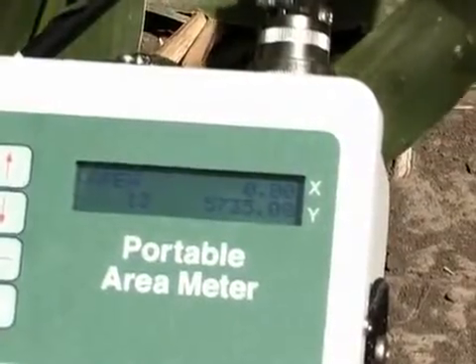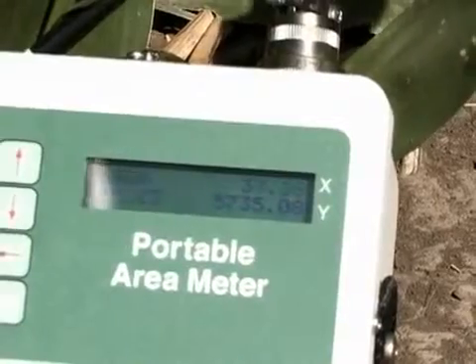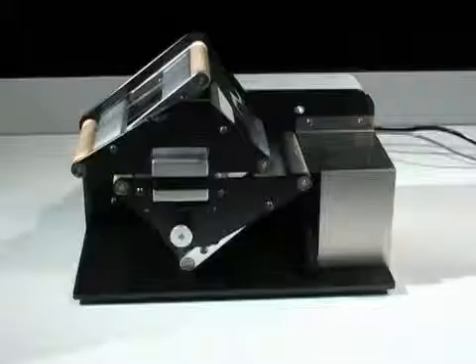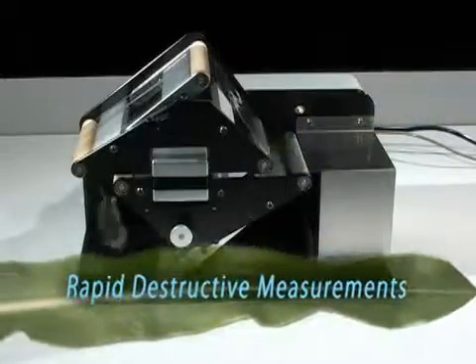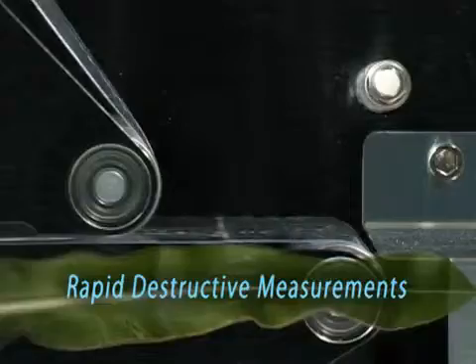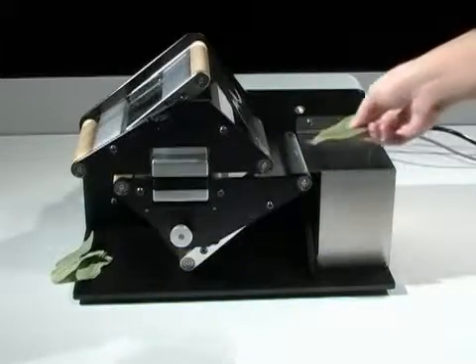The ease of use and versatility of the LI-3000C make it a very popular and scientifically accepted non-destructive leaf area measurement. The LI-3000C also can be used with the LI-3050C conveyor belt accessory, which allows users to run destructive leaf samples with the same instrument.